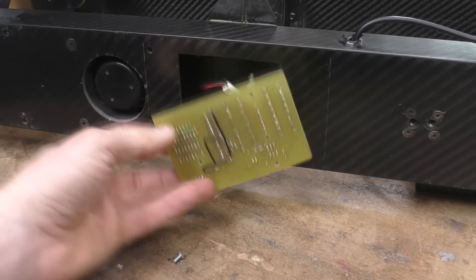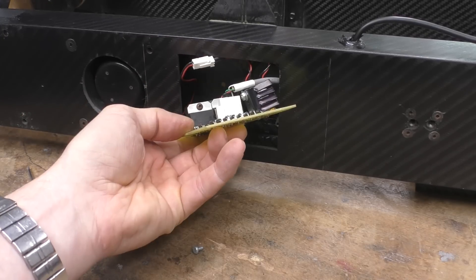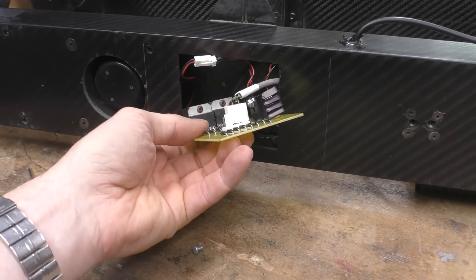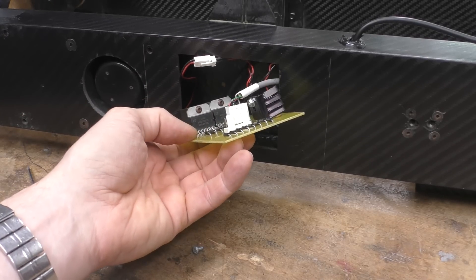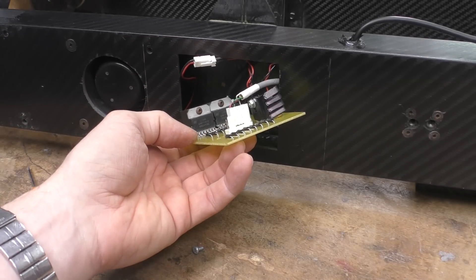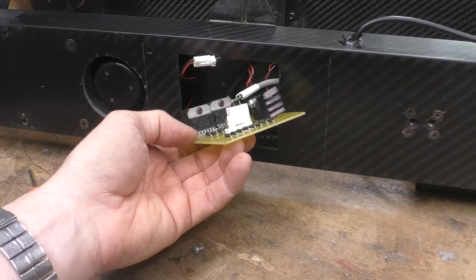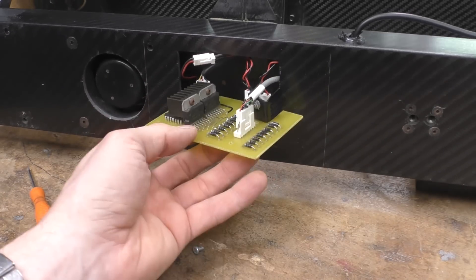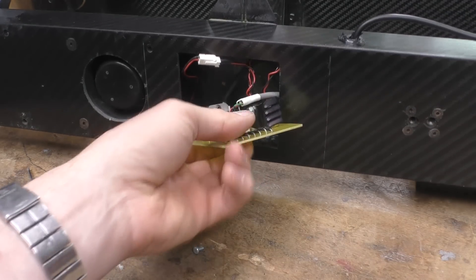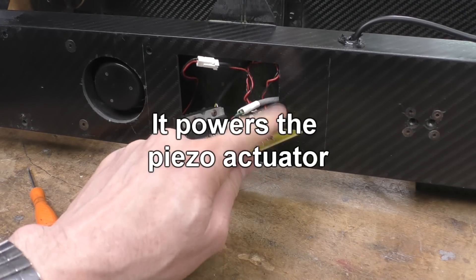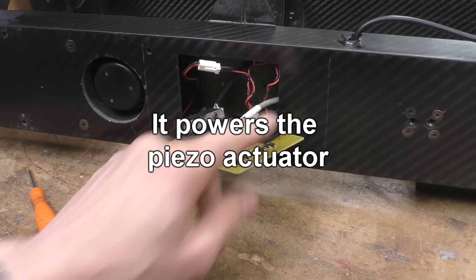Very old school. I'd imagine probably stepper motor drivers for driving motors within that motorized lens assembly. I think there's also a voltage regulator to provide power to the camera.